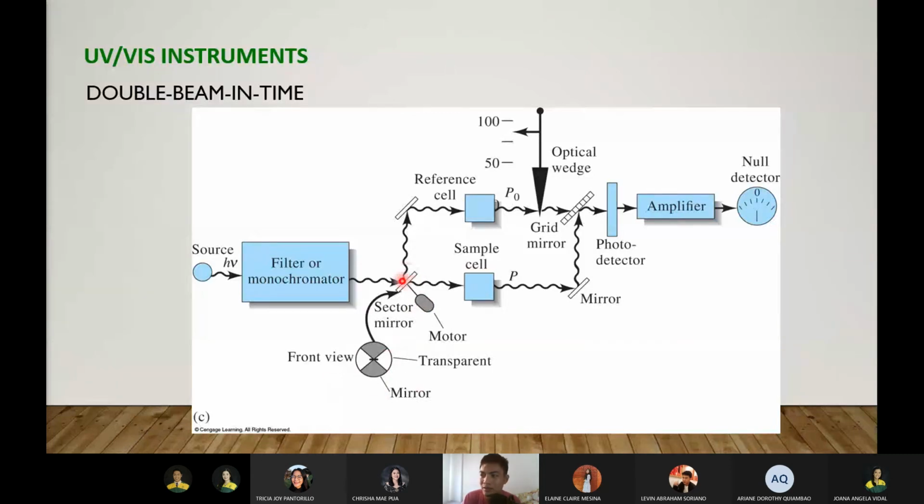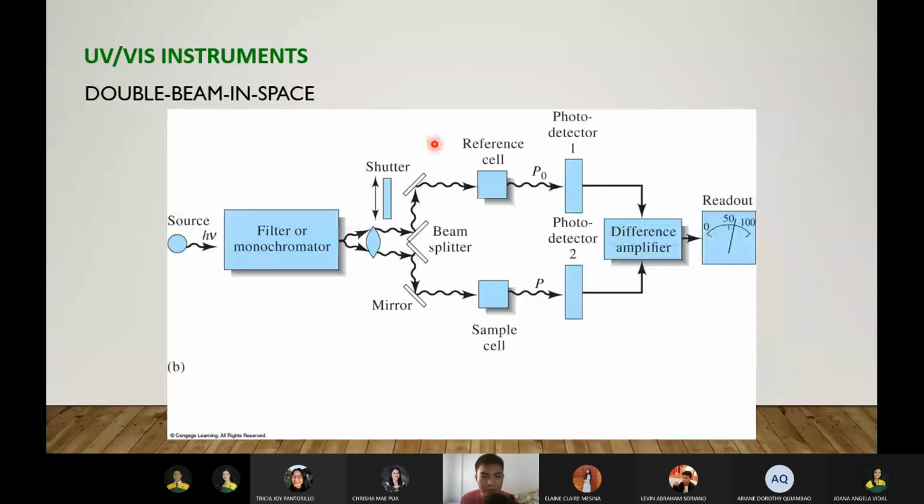Okay. So, may time na ito bukas, ito bukas, ito bukas, ito bukas, no? Okay. So, ganun yung nangyayari dito. Paikot-ikot tong mirror. So, nagsiswitching yung ating wavelengths. I'm not really sure kung anong application niya. Pero the common one in industry is this one, the double beam. Mas mabilis yan. So, wala pang 10 seconds tapos ka na sa analysis.